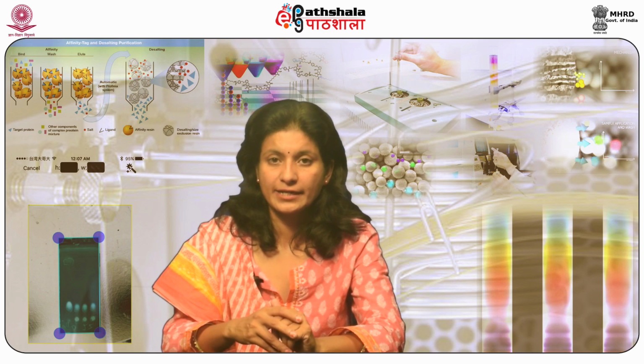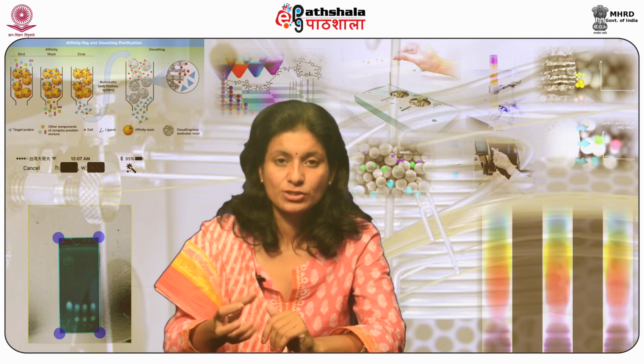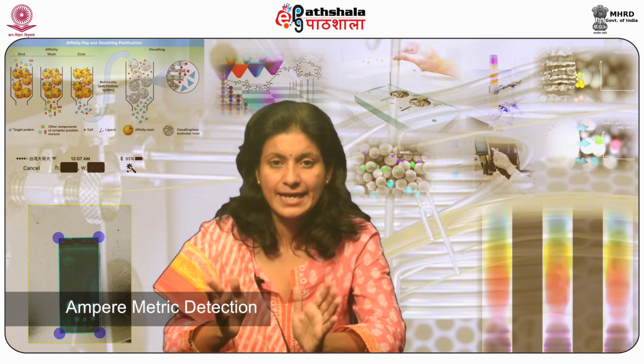The hydrocyanic acid thus resulted is evacuated by reflux distillation from the digestion matrix and absorbed by sodium hydroxide solution, which can be investigated for cyanide utilizing ion exchange chromatography with amperometric detection.